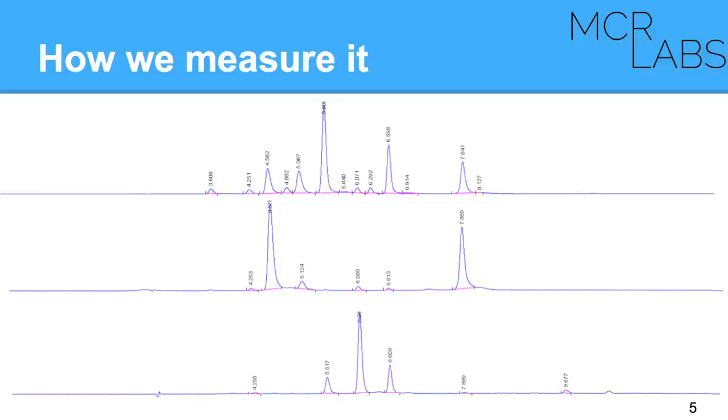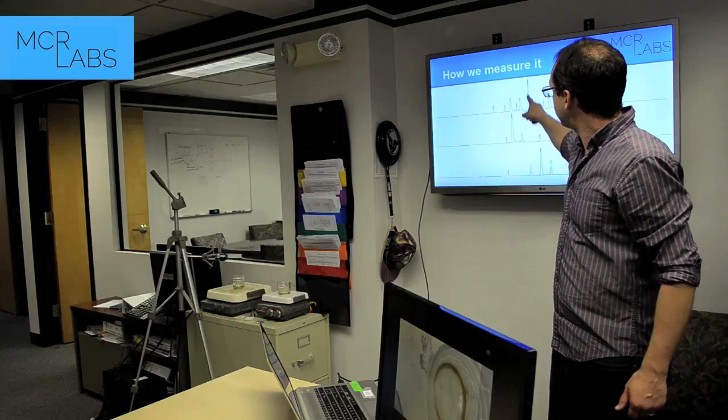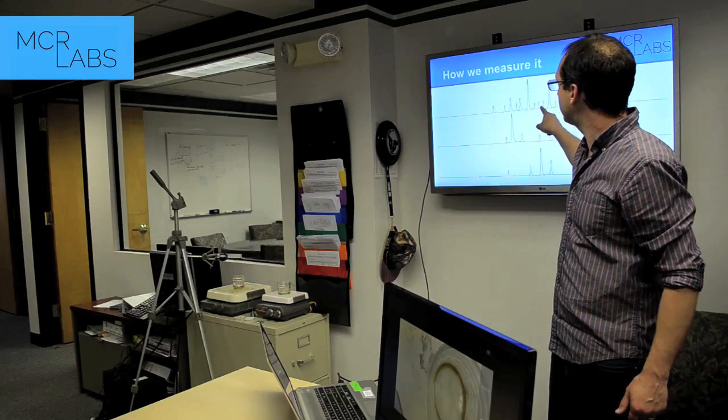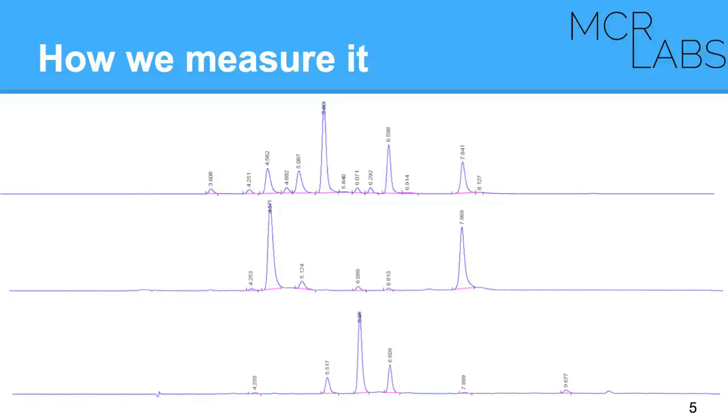That's what this was, injected like yesterday, and this is a vial that contains 10 different cannabinoids in it. That guy right there is CBN. This is THC. This is THCa. That's CBC. There's CBDa. There's CBD. There's CBGA. We do a bunch of different cannabinoids. The point here is that you can see individual molecules, and the size of the peak indicates how much of that molecule there is.